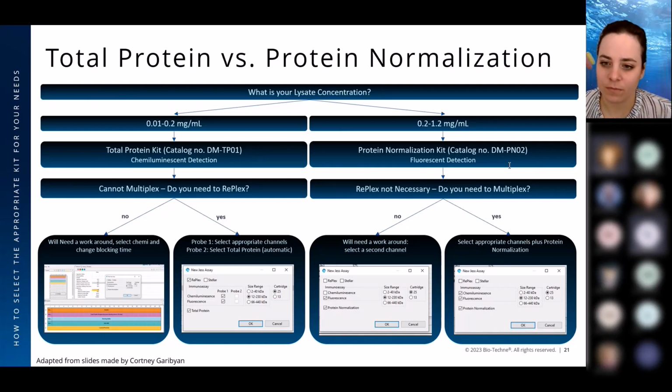But the point is that the graph for total protein normalization differs on the same lysates between the target antibodies that we're using. And so my question was, is that some sort of interaction between those antibodies and the protein normalization reagent, or how can that be explained in general?